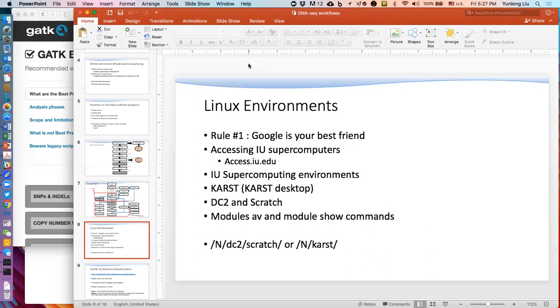Usually we see about 10% of the reads that cannot be aligned with the genome. This is normal. Some of them may be sequences that we have not seen. Others could be structural variations. There could be many different options. It could be bacterial contamination, which we have seen before as well. Who knows whether we know our genome 100% right or not. So there are many different reasons, and Sean talked about them.